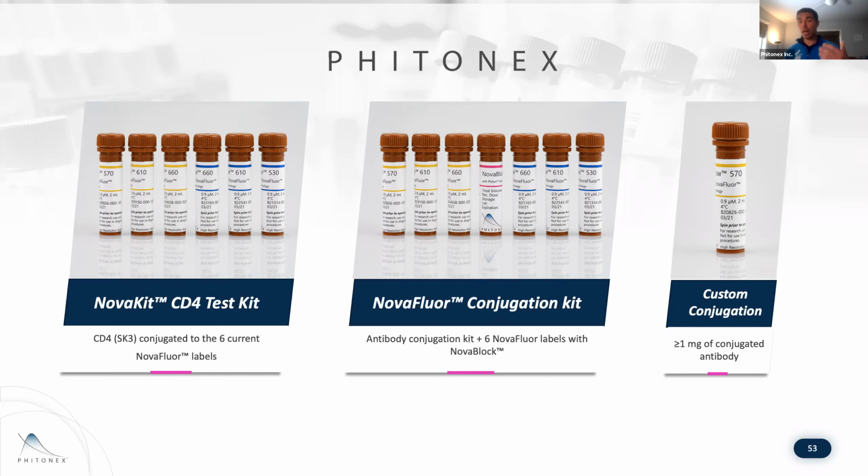So saying, look, I really want this CD marker attached to Nova Yellow 570 because that hits a channel across a number of my panels. And so we've worked with folks on that as well.